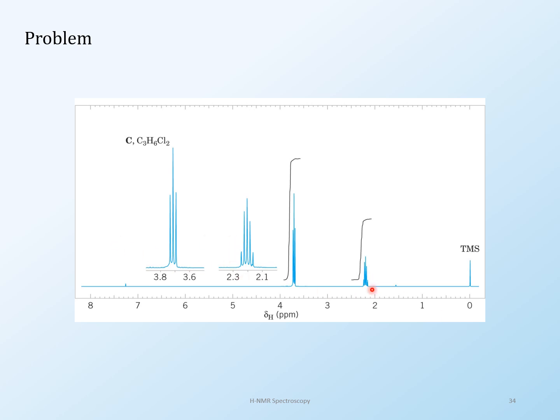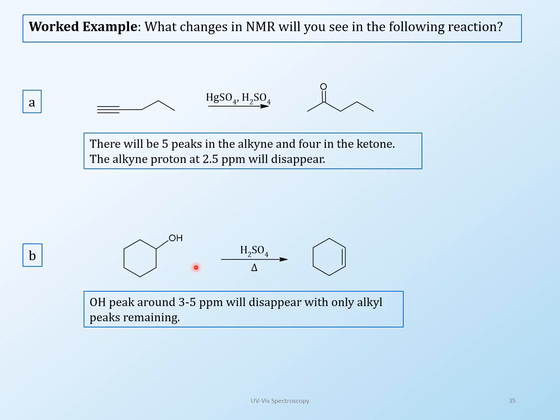Look at the coupling, look at the chemical shift, look at the number of peaks, and then figure it out. The molecular formula is very small, right? Hopefully that should help you, that you only have 3 carbons here to work with. All you need to figure out is how to get the correct splitting, right? Which here is quintet and triplet, and in the other ones there were some different splittings, okay? Feel free to send me the answers.